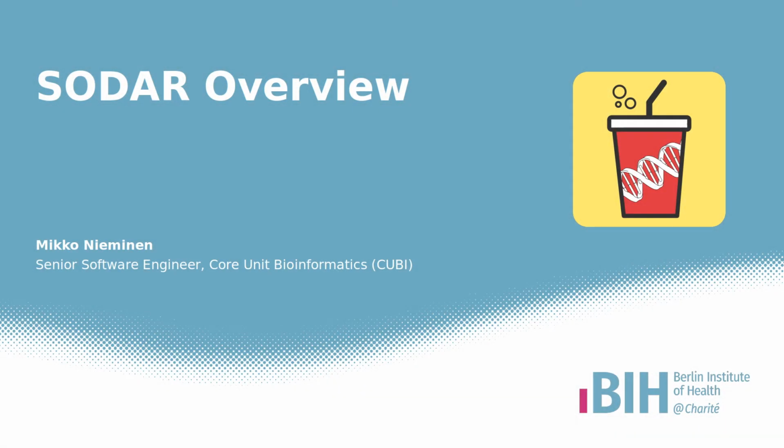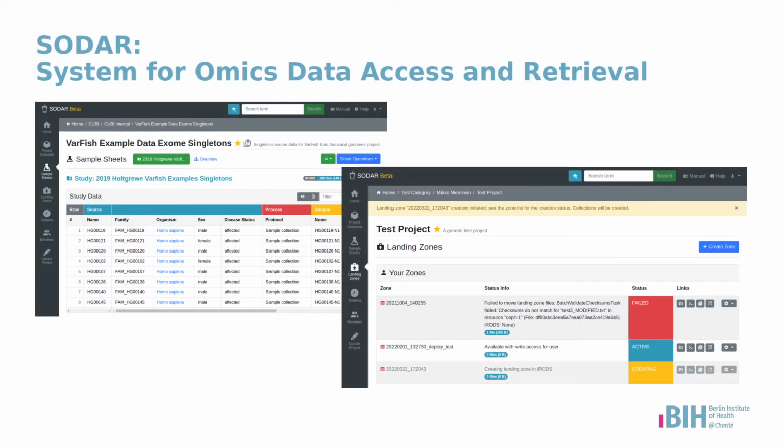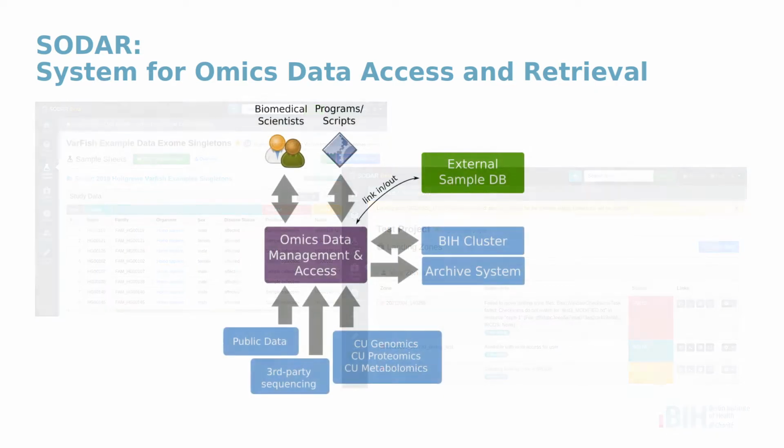This video presents an overview of the SODAR data management system. It is being developed by Core Unit Bioinformatics at the Berlin Institute of Health. SODAR stands for the System for Omics Data Access and Retrieval. It is specialized software for managing study data in various omics research projects.